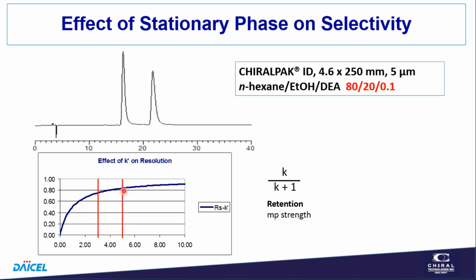And so thinking about the backwards way of thinking about this diminishing return: if there's a diminishing return and an increasing retention factor for improving resolution, maybe if we decrease retention, we pay a small price in less resolution. So I don't have the experimental details, but I would expect that we would probably get faster analysis going to lower retention and probably still have adequate resolution. But it'd be certainly an experiment worth running. So maybe try 70-30 on this.